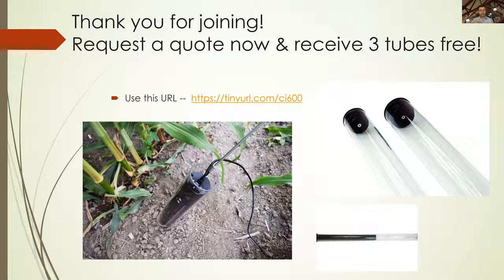All right, the next question is, any reason for not being able to save a traced root image for later viewing and analysis on the computer outside the software? Actually, that's a good question. I think one of the more recent updates with the software has been to be able to save those traced images as actual images. So you see the tracing simply because I was able to do that for this slide presentation. But if you're asking for the data associated with it, that would be part of the software since it is a lot more data and needs to be handled differently.